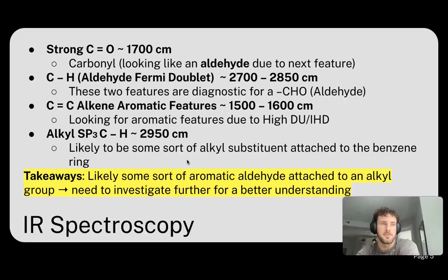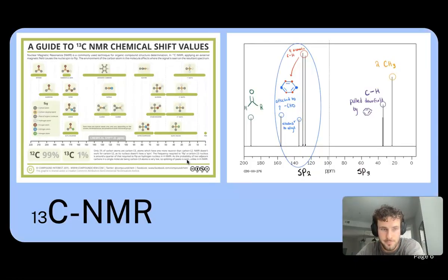So some takeaways after looking at the IR spectrum. It's likely that we have some sort of aromatic aldehyde attached to an alkyl group. However, we need to investigate a little bit further for a better understanding.